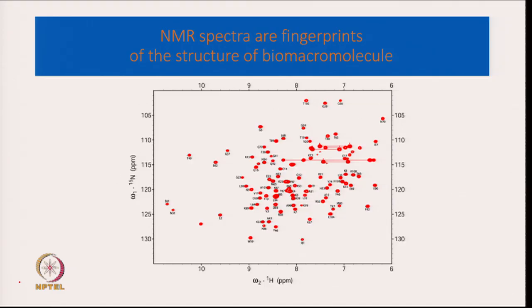NMR can also be used to see the structure of biomolecules, for example, proteins. They are basically fingerprints of the structure of the molecule.